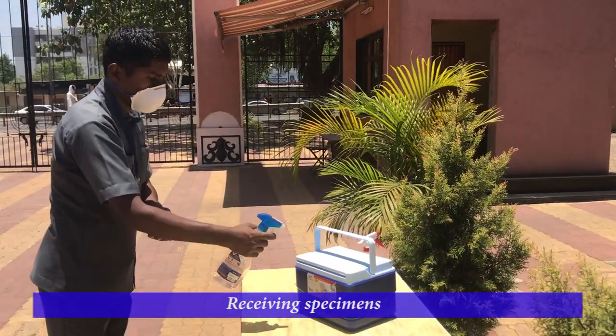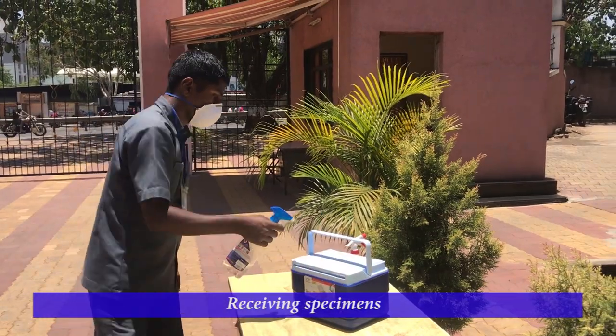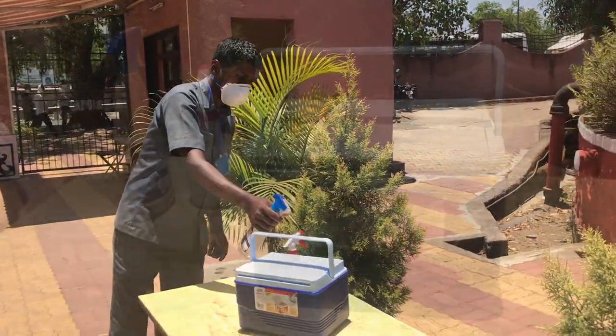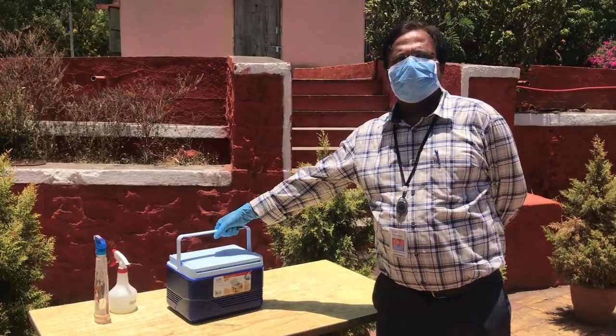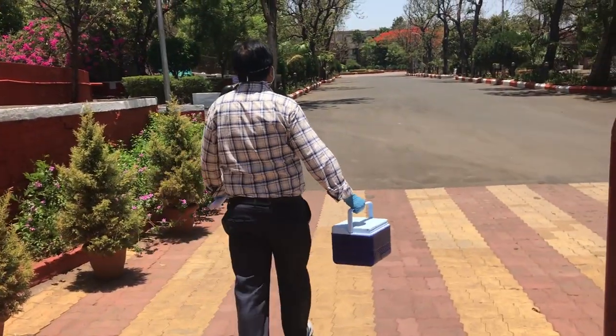Security from the gate will inform the concerned laboratory about the arrival of specimens. A lab staff will come to the gate to pick up the specimen container wearing a pair of gloves.